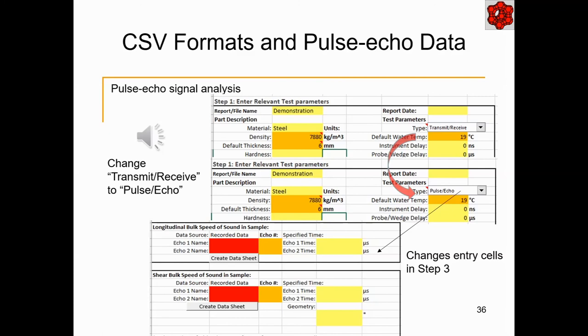Next, we consider pulse echo signals. When using pulse echo data after recording the relevant instrument parameters, we must switch the type entry from transmit receive to pulse echo. Although there is an entry cell for the temperature, the water temperature will not be used when using two multiples of a pulse echo setup. When pulse echo is selected in step 1 section, the data entry option changes in the step 3 section. Now we see that there are two red cells in each of the longitudinal and bulk speed categories.